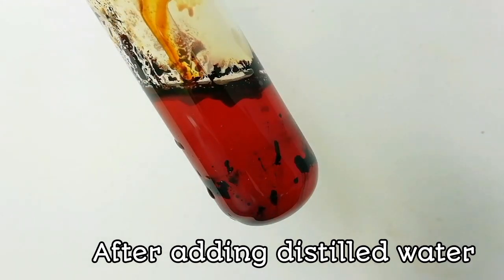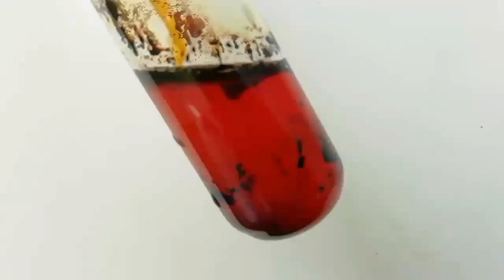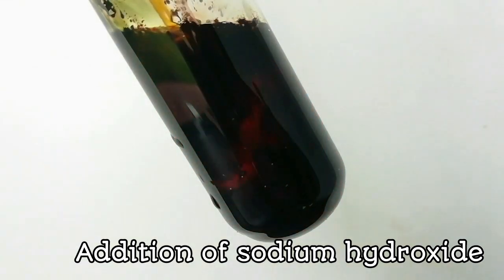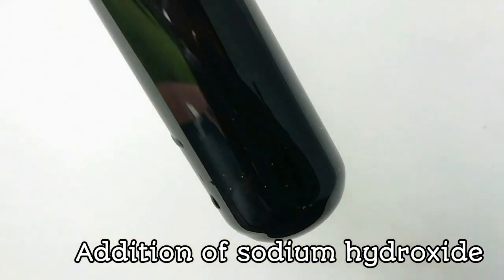When the solution is diluted by adding distilled water, it gives a red color due to the formation of indophenols. Finally, add sodium hydroxide solution and observe the color — a green coloration can be observed. These positive results are given by phenols which have para positions free, for the Liebermann nitrosophenol reaction.